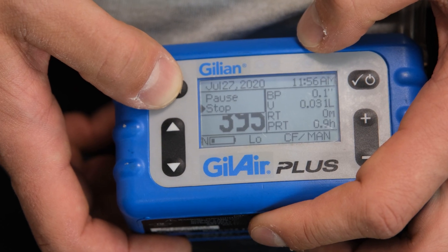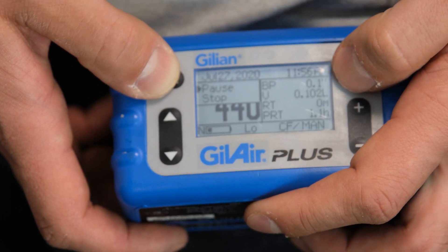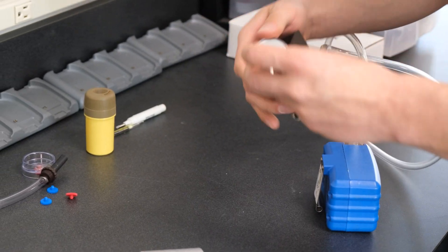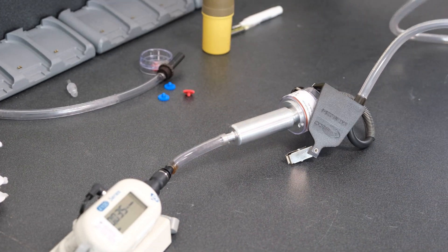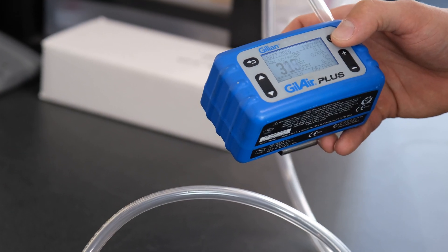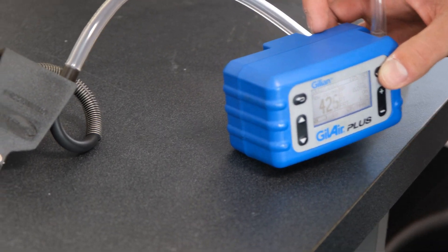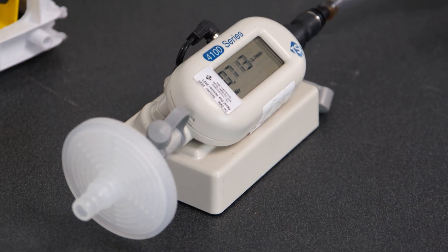Turning the sample off — now we've completed our STEL sampling at the end of the day, or maybe our time-weighted average sampling. We paused the sample, pull it off the employee, unhook it, fill out our chain of custodies as necessary, and perform our post-calibration. Putting it into our 4100 series calibrator, keeping the same flow rate as we had, clicking run, and recording the 4100 series calibrator reading. We can then average the pre and post calibration together and develop an average flow rate that we use to determine our sampling results.